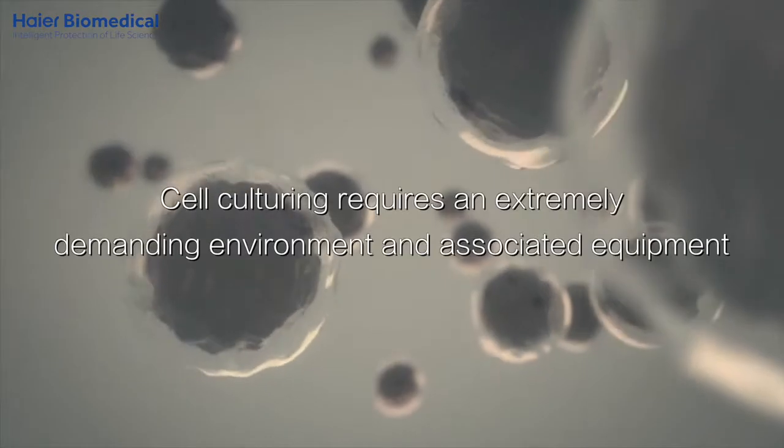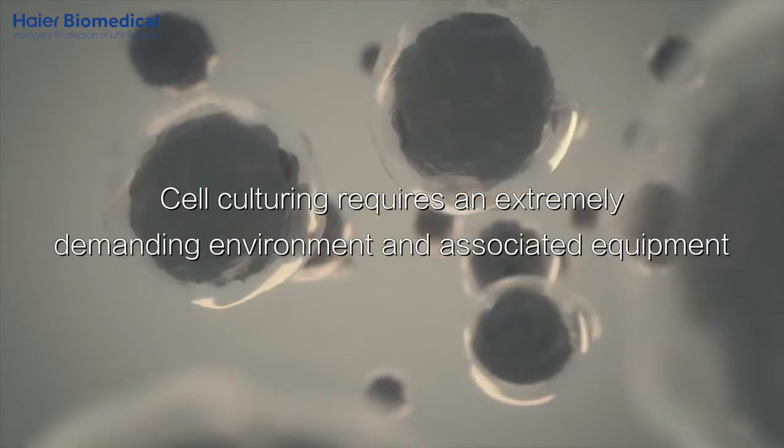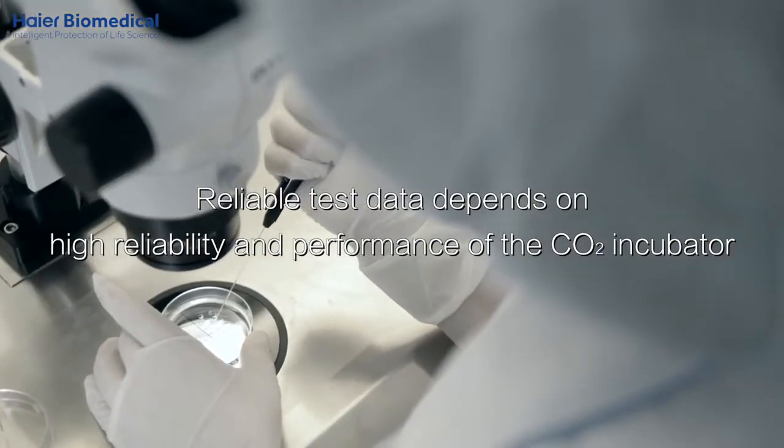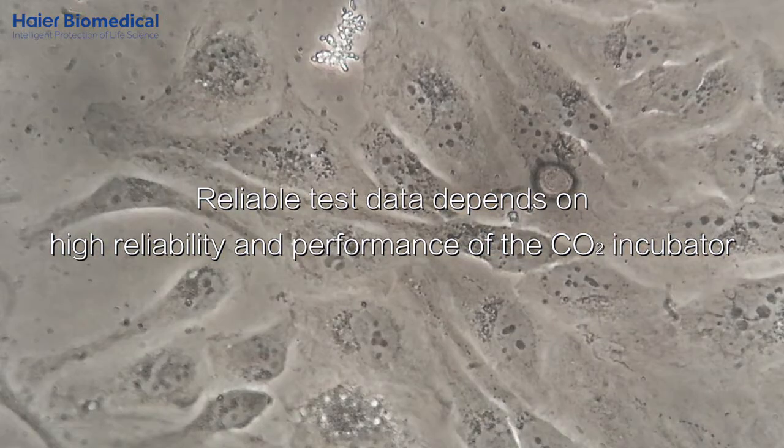Cell culturing requires an extremely demanding environment and associated equipment. Reliable test data depends on high reliability and performance of the CO2 incubator.